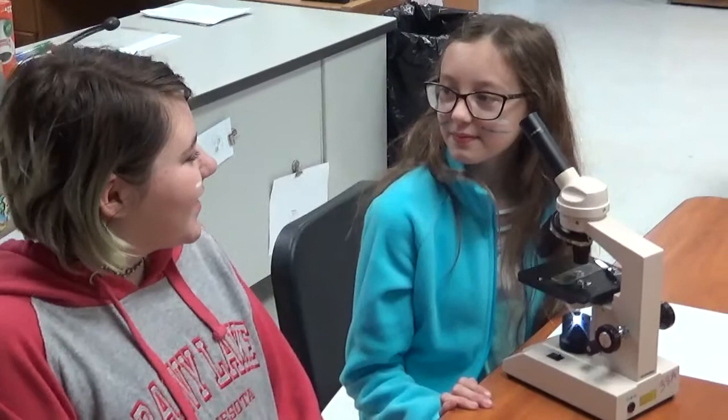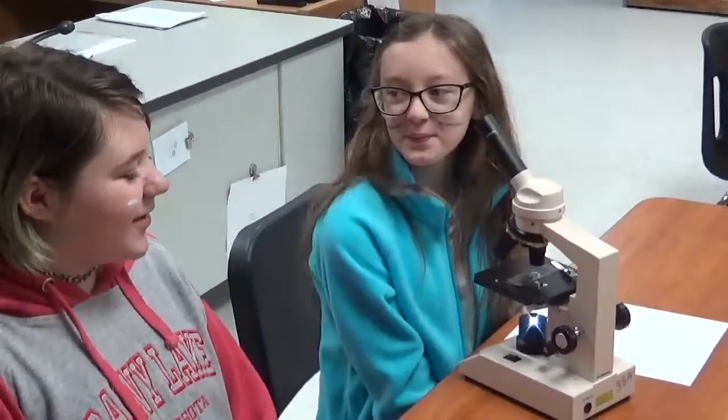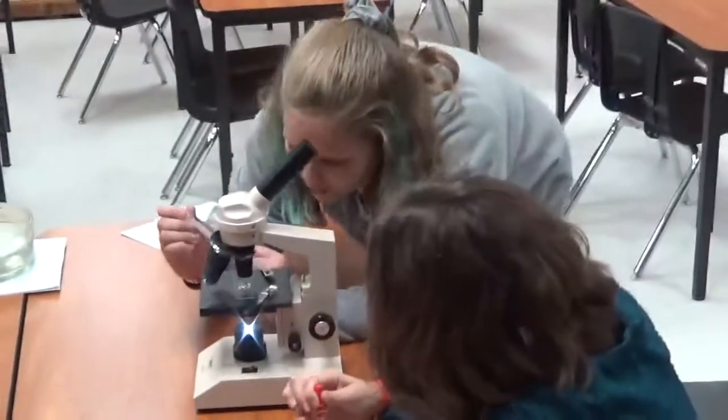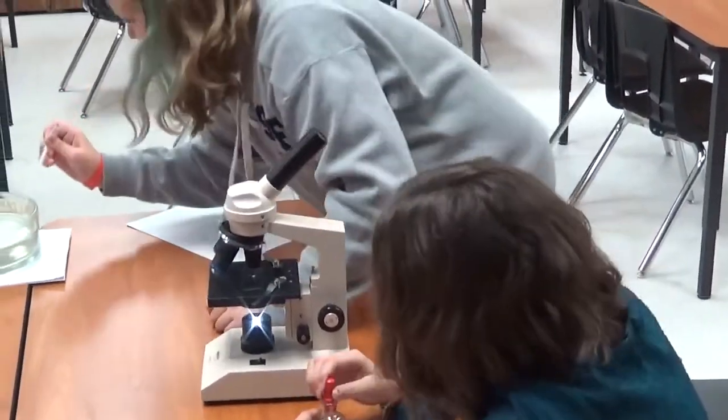What are we measuring in this lab? Our results variable, which is the Daphnia's heart rate. We have to make sure we keep water on it. It's one of our constant variables. Yeah, and those are things we have to keep the same.